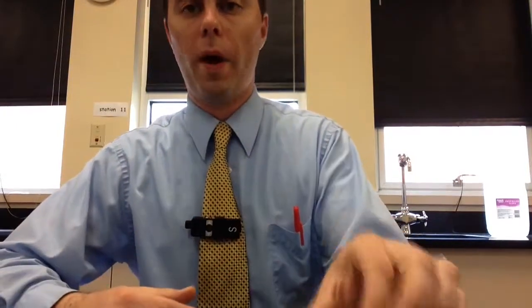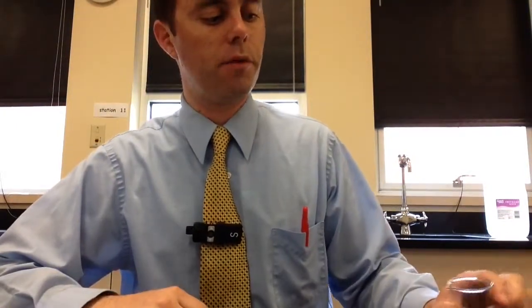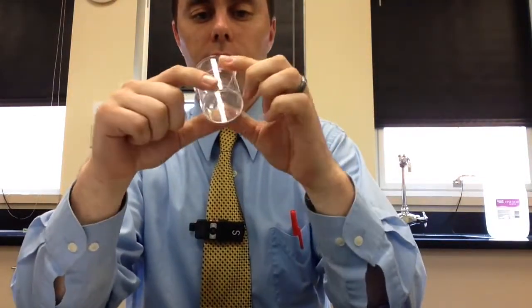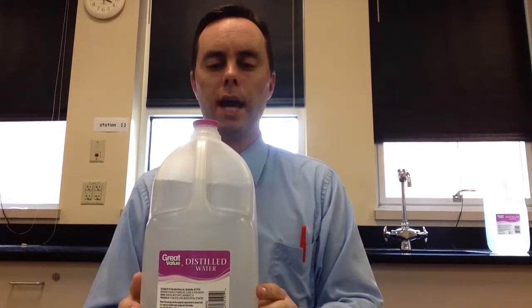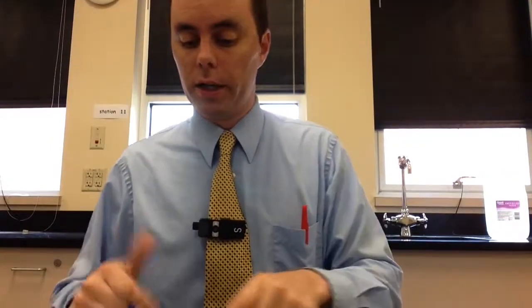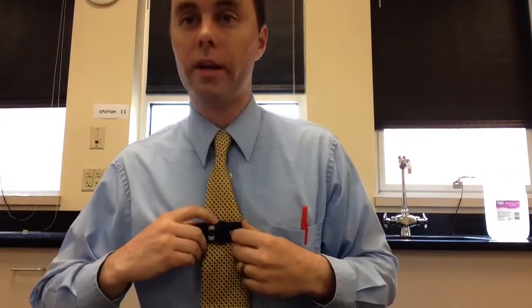Next step is exactly the same, except you're going to be using sugar instead of salt. So you'll take 3 grams of sugar, weigh it out on the scale just exactly as you did before. And it's critical that the beakers you're using are absolutely clean and dry. If they've got any contamination in them, you're going to be getting some false positives. So that means you're going to have to use this jug of water to rinse those things out before you even begin. Rinse them and then dry them all the way with a paper towel. Be careful not to touch the edges of it or anything like that because that'll contaminate it. So like I said, get the sugar in there and then we're on to the next step.